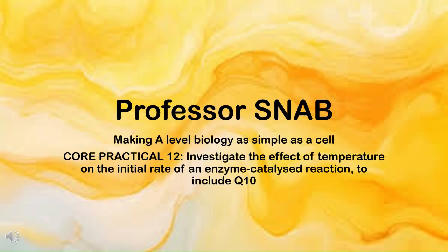So today we're investigating the effect of temperature on initial rate of an enzyme catalyzed reaction. And this also includes talking about the temperature coefficient, which is Q10.